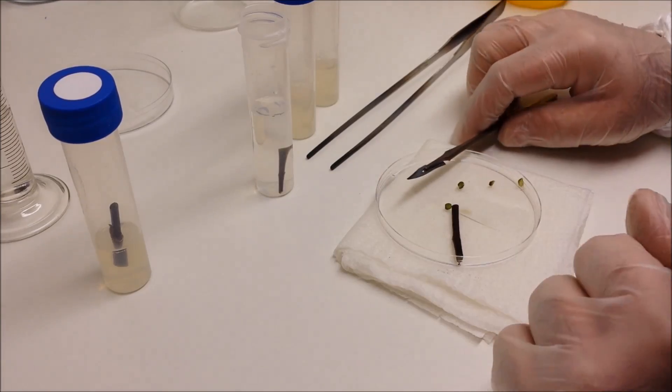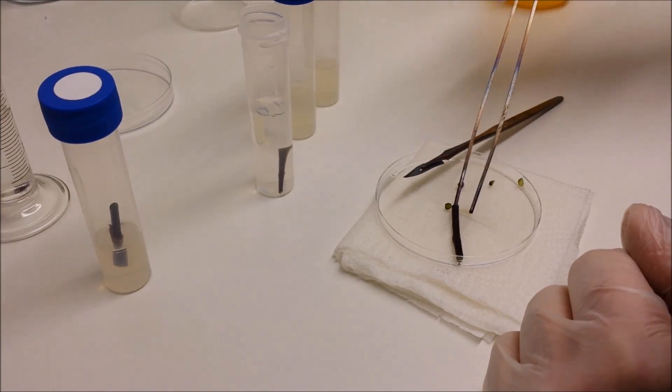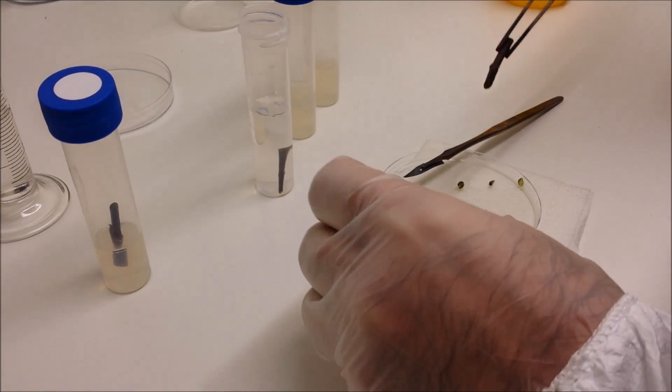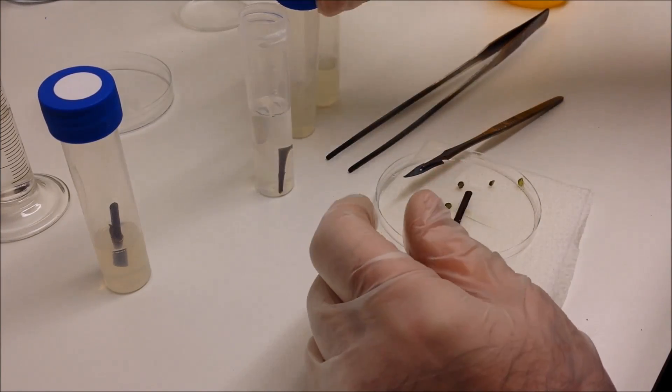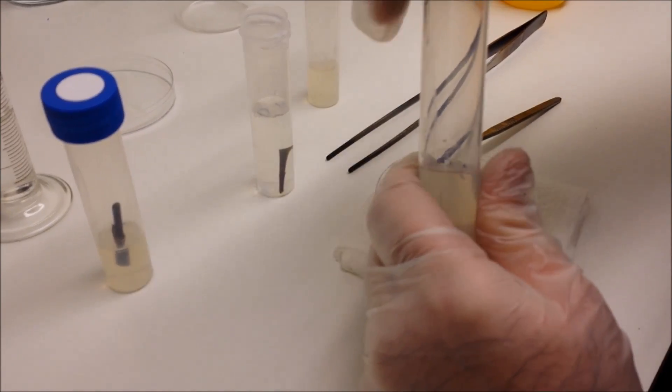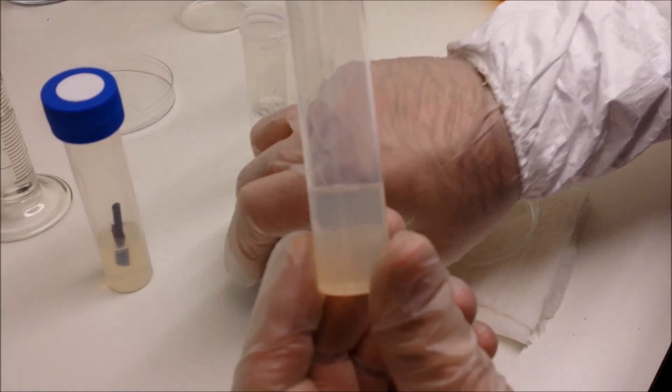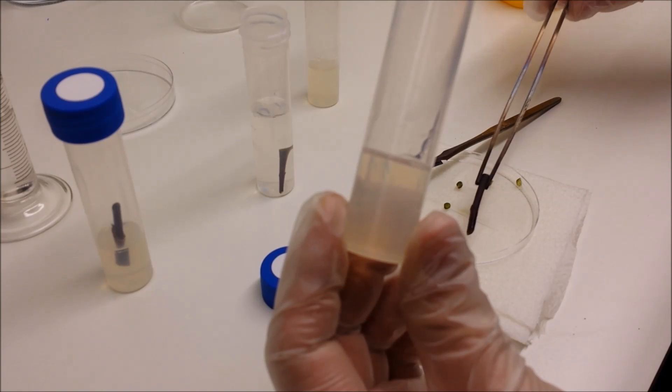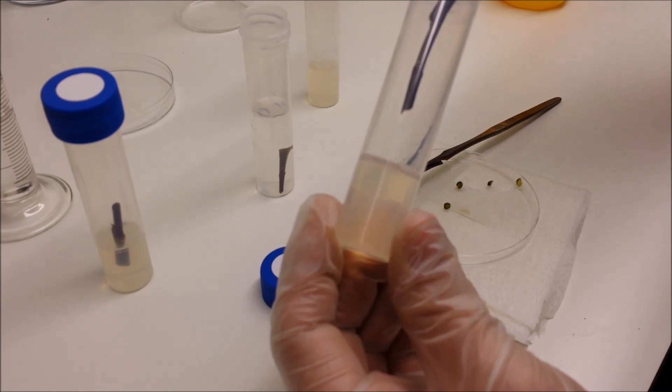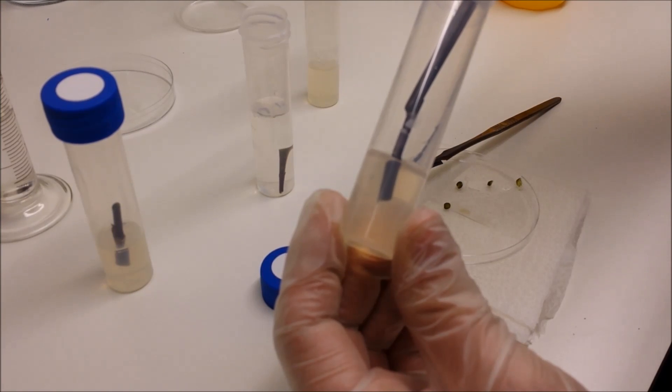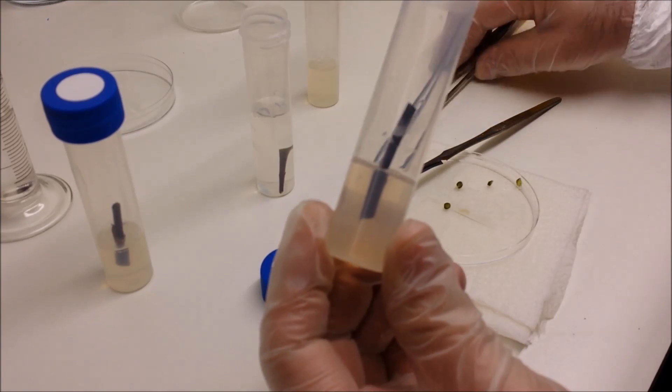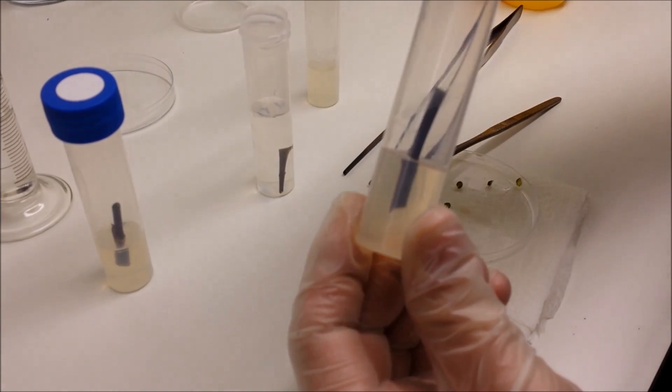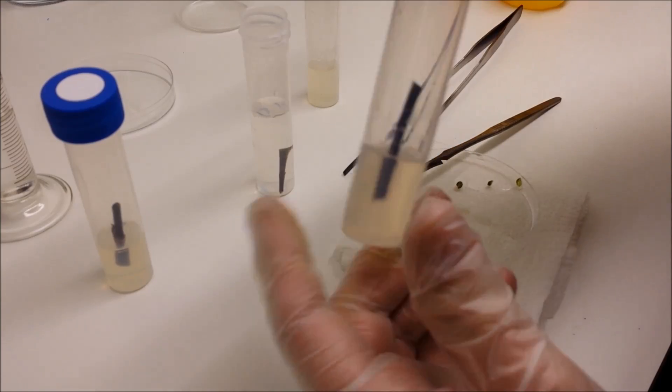Again, pointed end down. Place the lid onto the sterilized surface. Try not, if possible, try not to touch the insides of the glass or plastic tube with anything. Keeps it as sterilized as possible. That's the second one done.